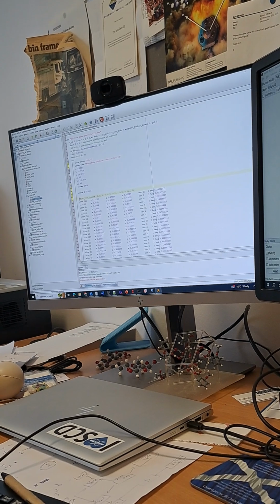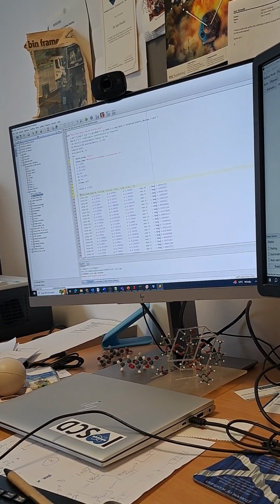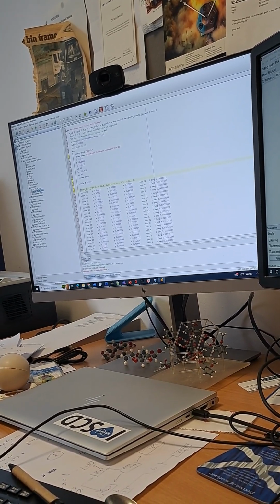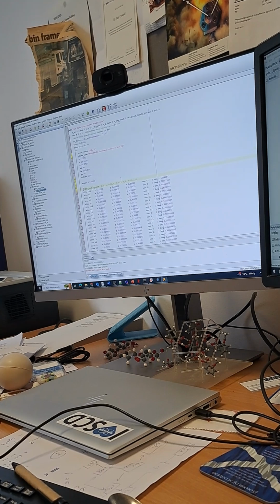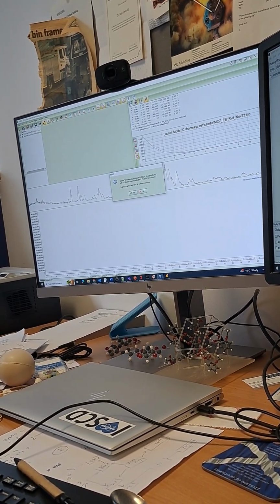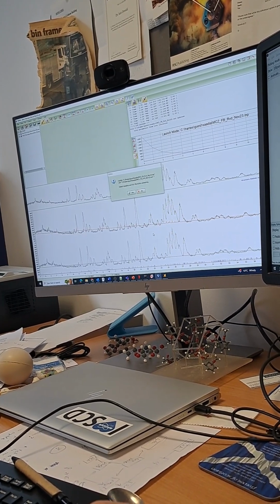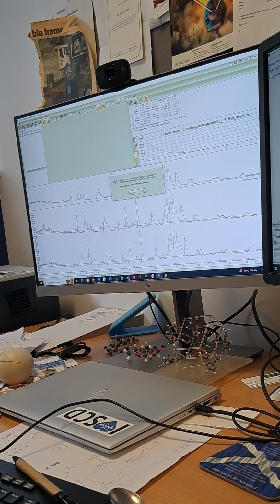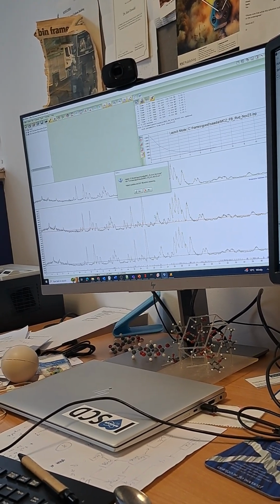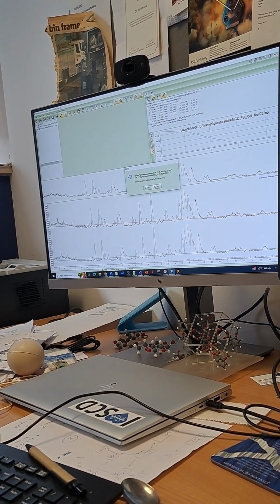But you can see all these other things. Lattice parameters are already in, sites are already in, preferred orientation we haven't done, but presume that it isn't. The rest of it we can come to if need be, but for a simple structure, let's just go with that. If we click on this now, you can see it's disappeared, but we're in a much, much better scale-ish. Okay, we're roughly there. So we can click yes to that and click yes.